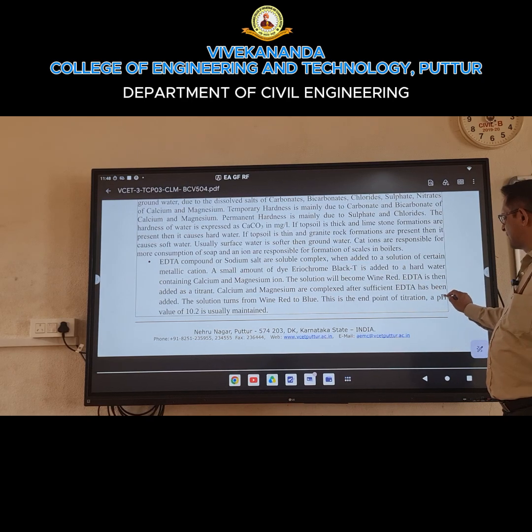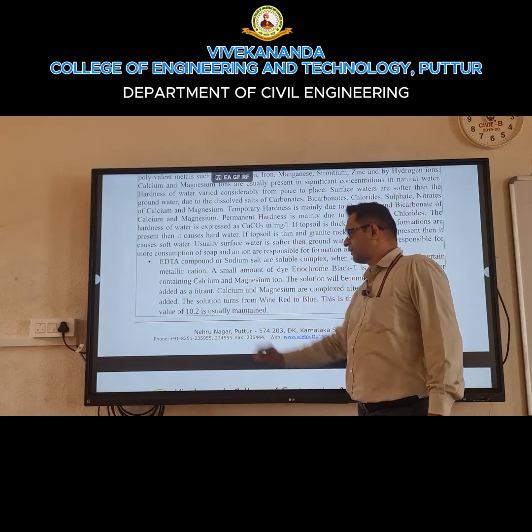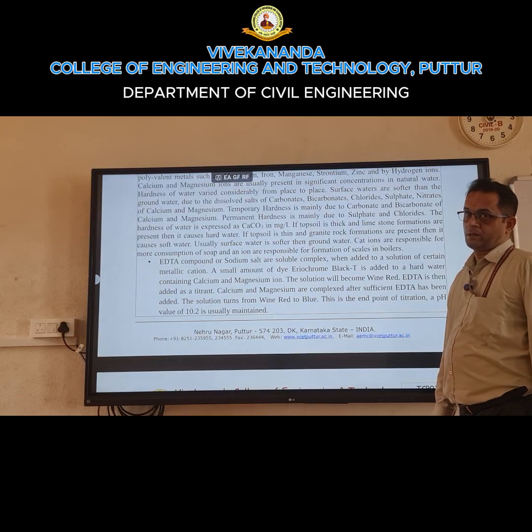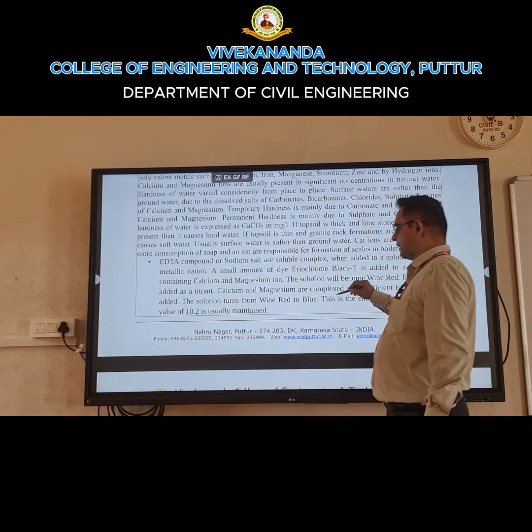During the titration, generally the pH is maintained. The value is maintained at 10.2. For that I will add the ammonia buffer. So the buffer solution is added before the indicator is added, right?